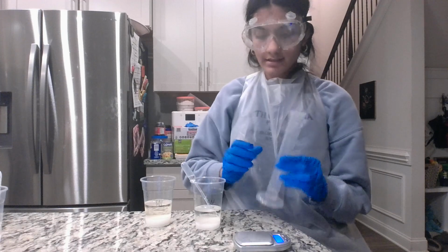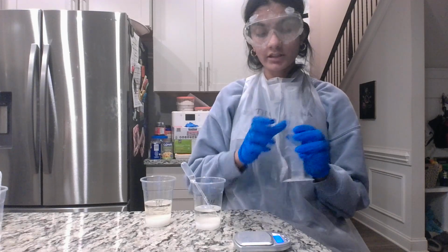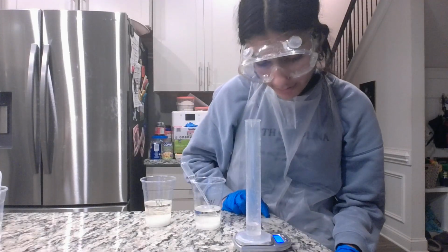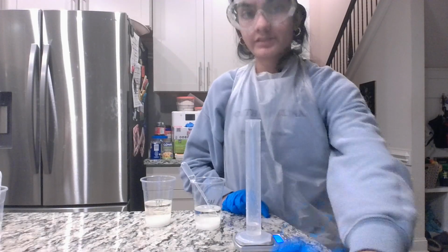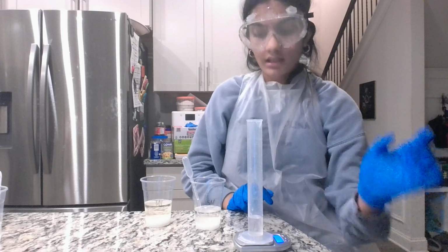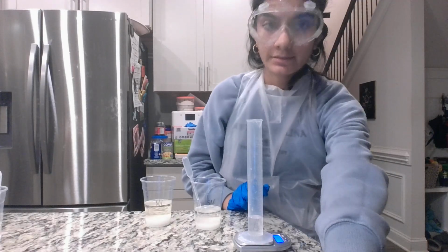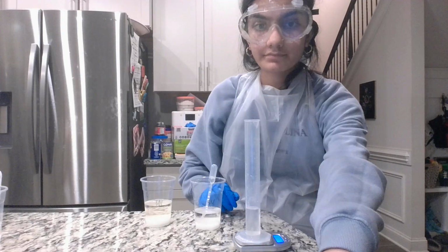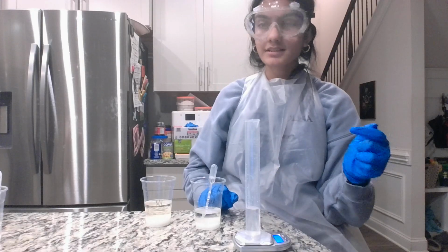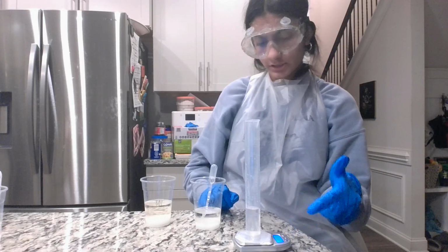So now this has 50% of sucrose in solution, and this is 5 milliliters, and it weighs about 36.65 grams. This is 10 milliliters, and it weighs about 42.11 grams. This is 15 milliliters, and this weighs about 48.13 grams.